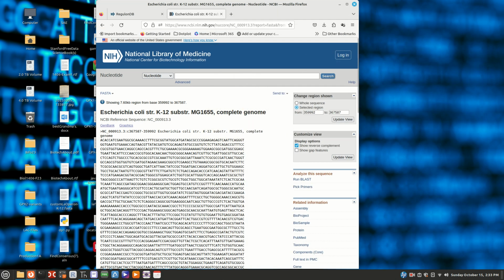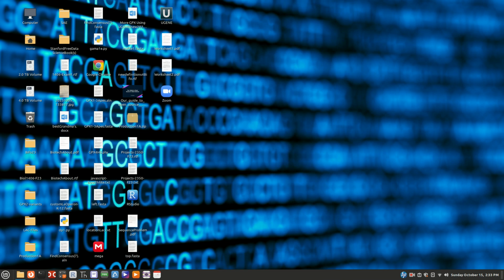Alright, so what do we need to do next? Well, I am going to take that. What did we call it? I have locations, and I saved it, custom LAC-Operon.